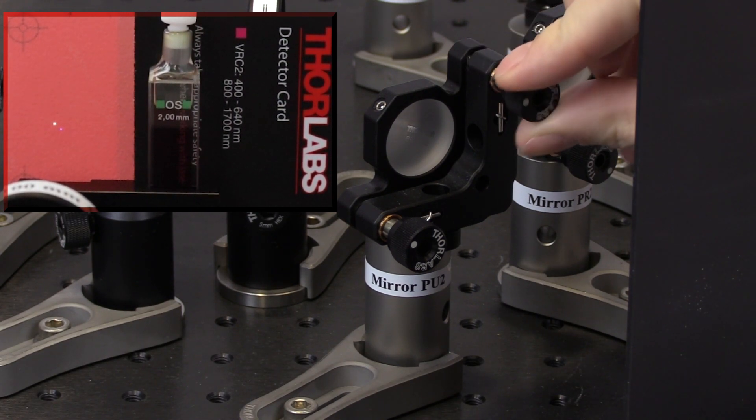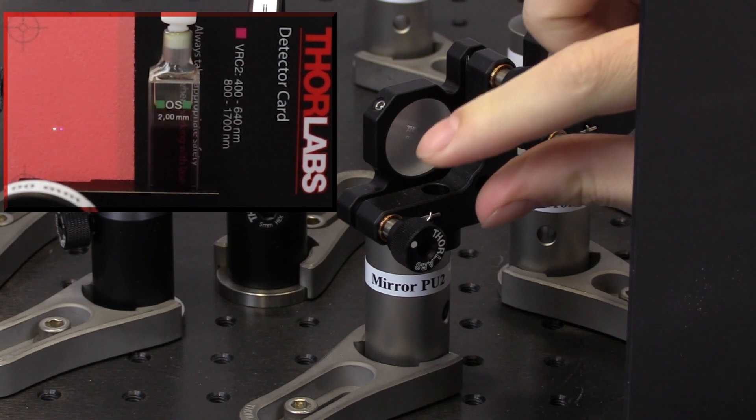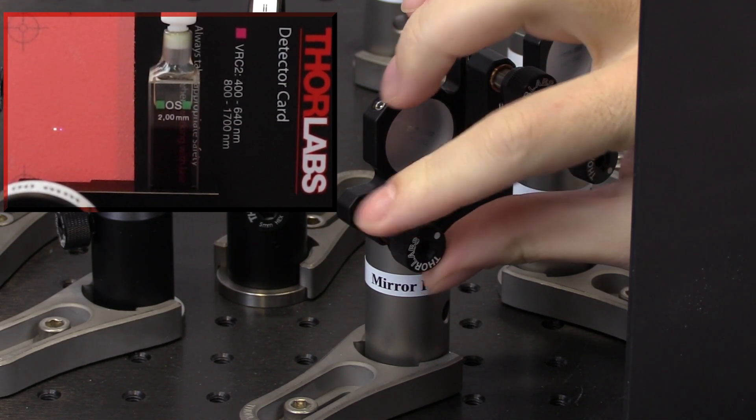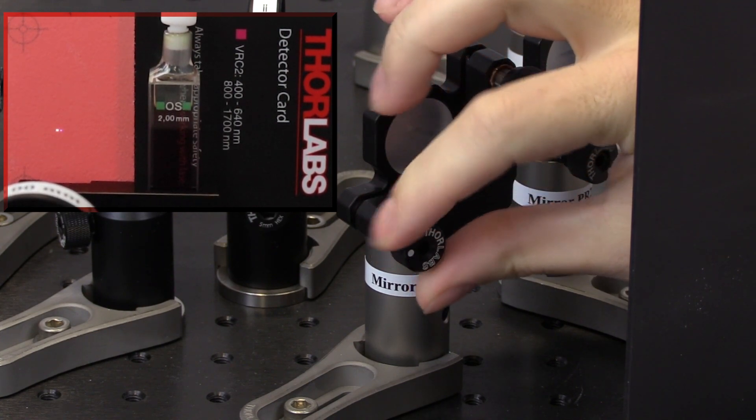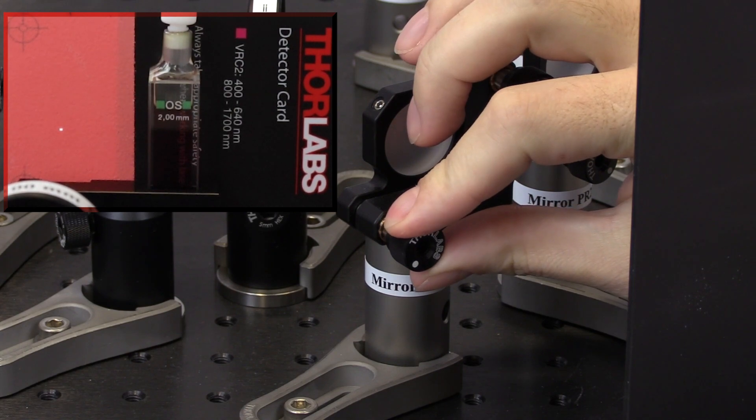The top right adjuster translates the vertical beam position. Adjust this knob until the two beams are vertically aligned. The bottom left adjuster changes the horizontal position. Adjust this knob until the two beams overlap.